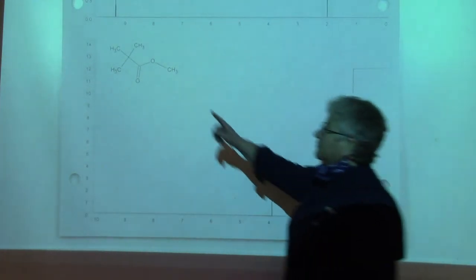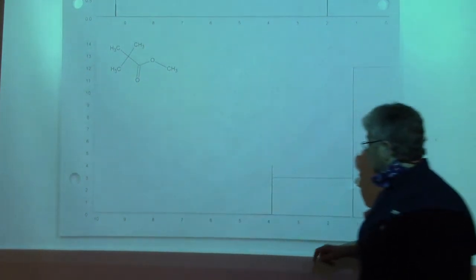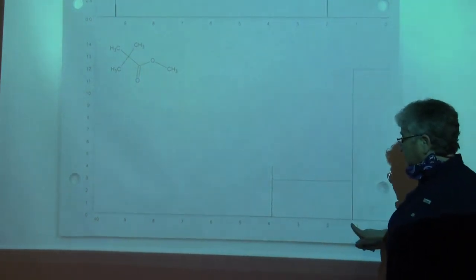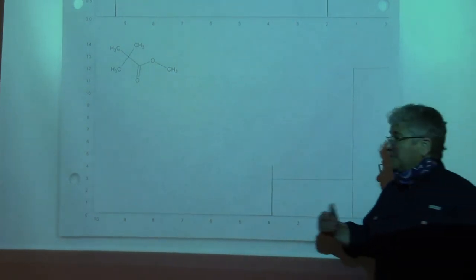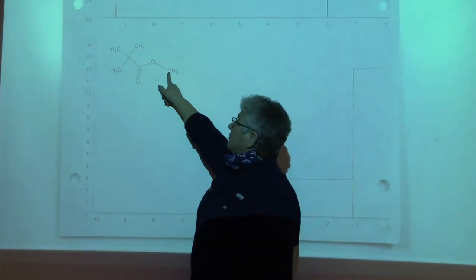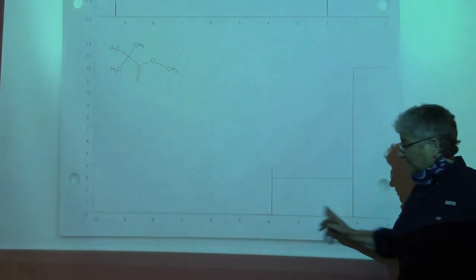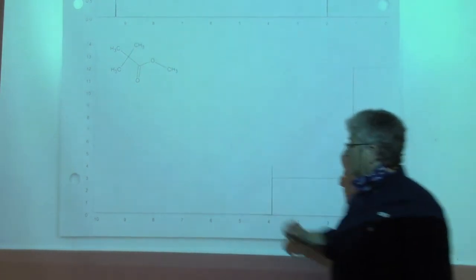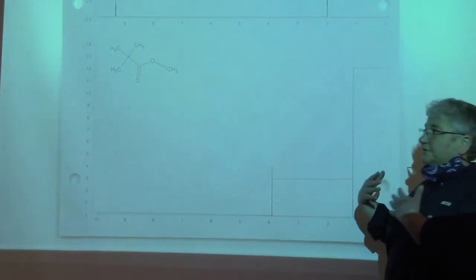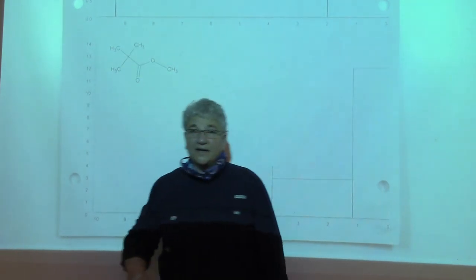All of these methyl groups are the same, different from this methyl group, and so what you see here is 2 peaks. And you can probably imagine that these hydrogens are bound to a carbon, bound to an oxygen. Oxygen sort of pulls things downfield, so these are going to be that one. And this peak upfield is alkane-like hydrogens, and those are alkane-like hydrogens.